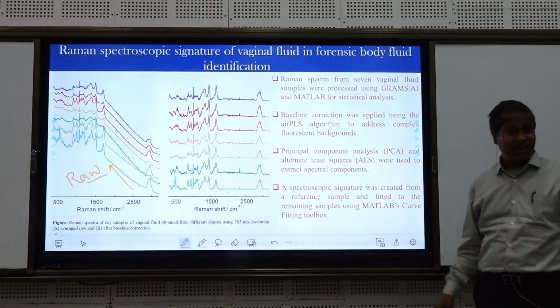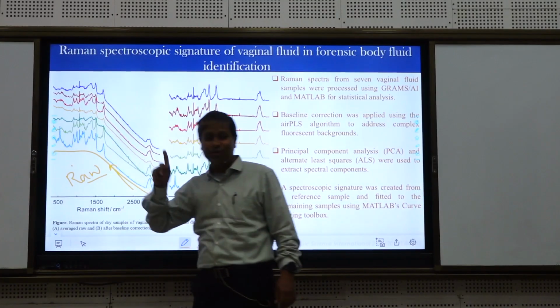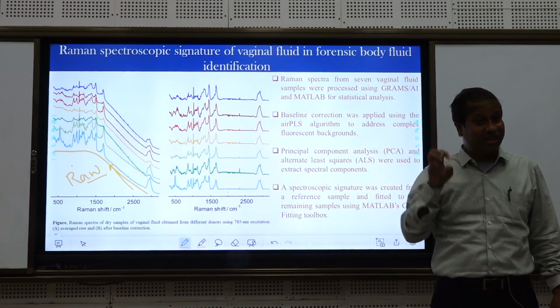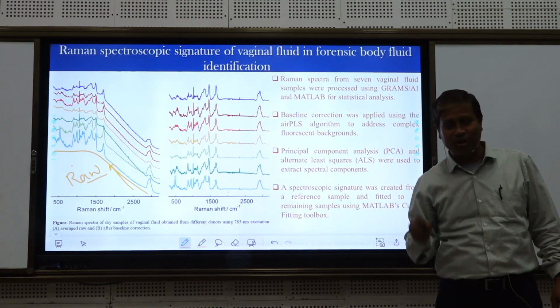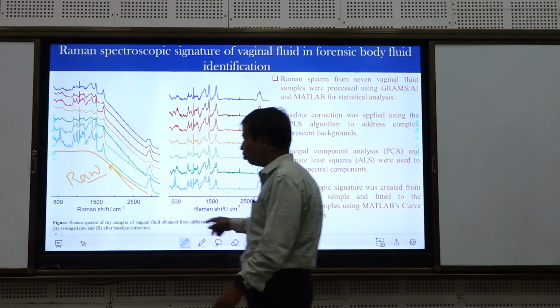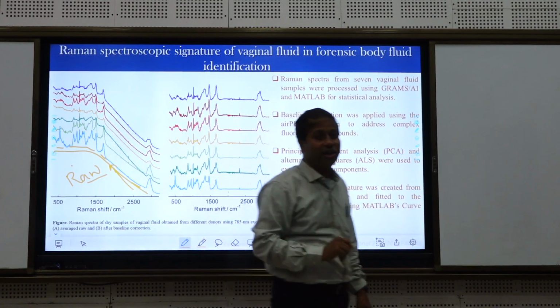See, so much change. And baseline correction is not just that you correct this much baseline. It has some mathematical significance. Whatever polynomial you are using, why you are using that polynomial is not just that you select it like that and then deduct it. It should have meaning.